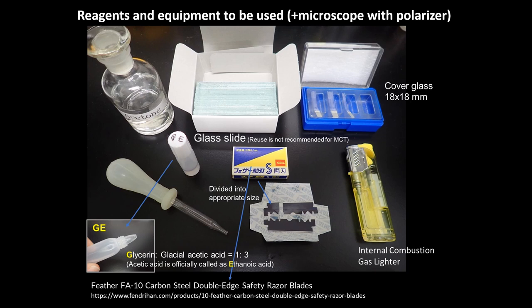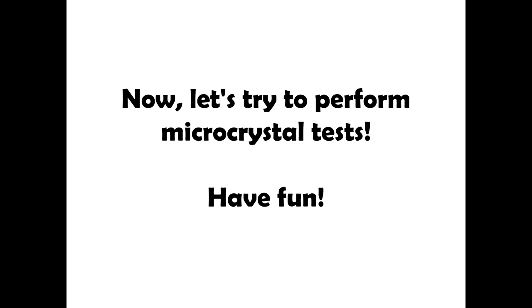Reagents and equipment to be used in the following video are shown here. Now, let's try to perform microcrystal tests. Have fun!